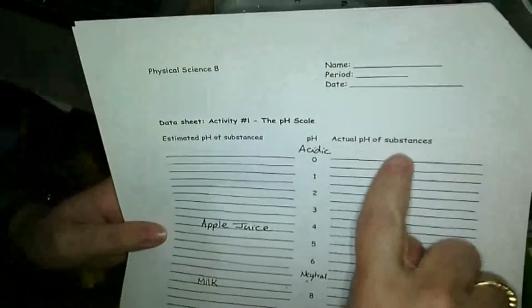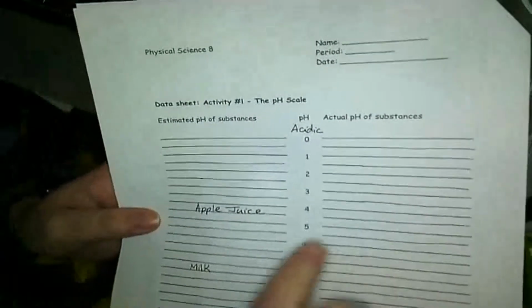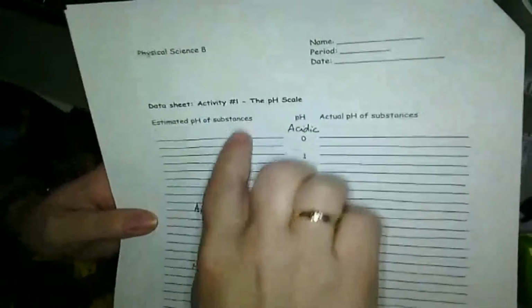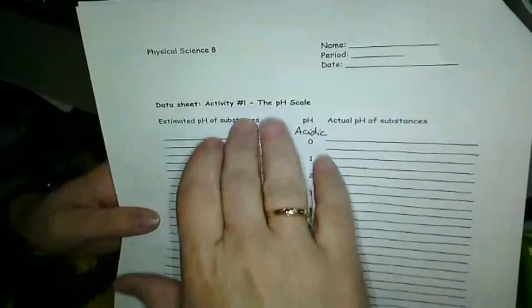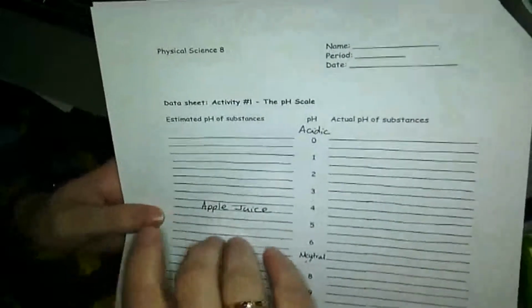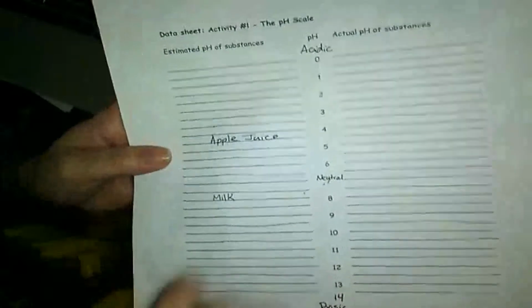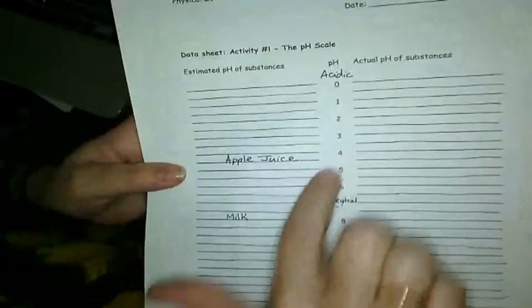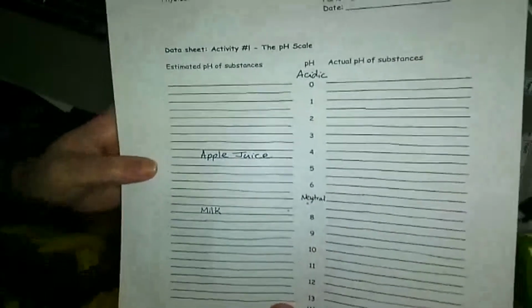On the left-hand side is the estimated pH of substances, and on the right-hand side is the actual pH of substances. What we're going to do first is you guys are going to take a guess. So you're going to fill in this column over here, the left-hand column. You can see that I did it earlier. So period 1 made a guess. Their guess is that apple juice is about a 4 on the pH scale, and that milk was about an 8.